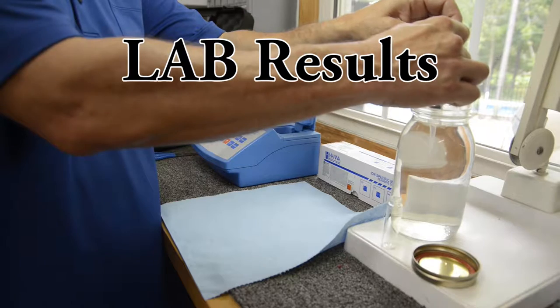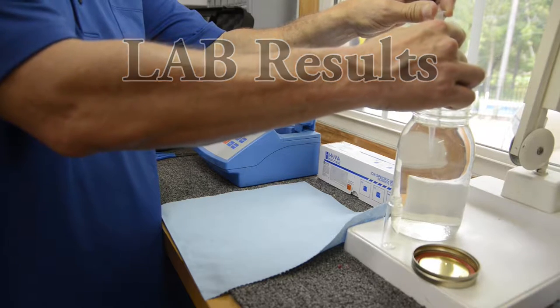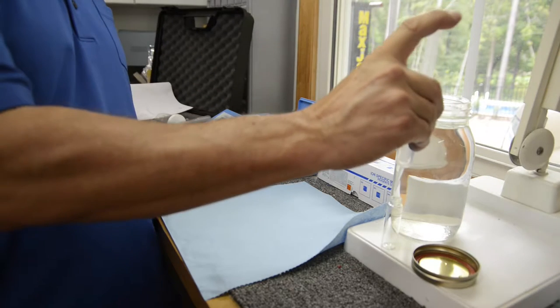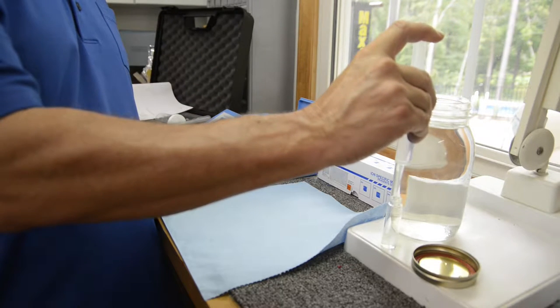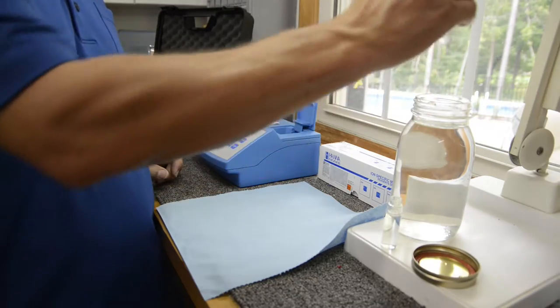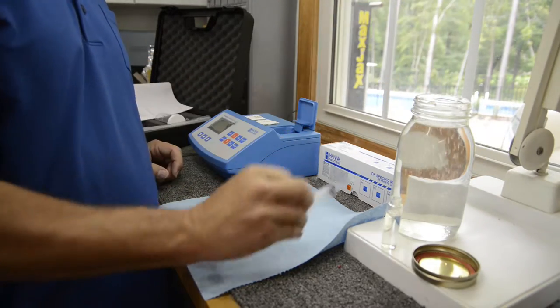So here we are in the lab, and this is a control - this is water that has not been bubbled from our greenhouse. This is going to give us a baseline. We need to know where the starting level of nitrate was before we bubbled it.